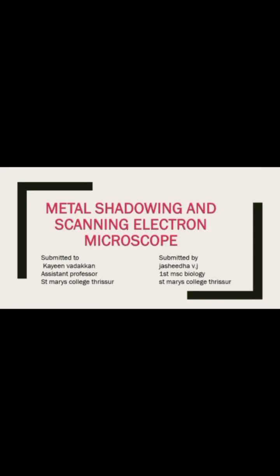Hi everyone, today's topic is metal shadowing and scanning electron microscope.